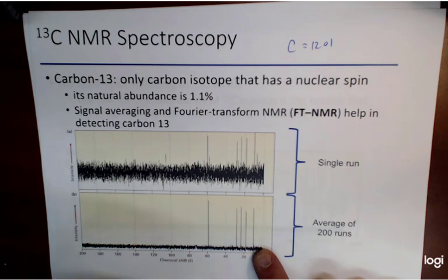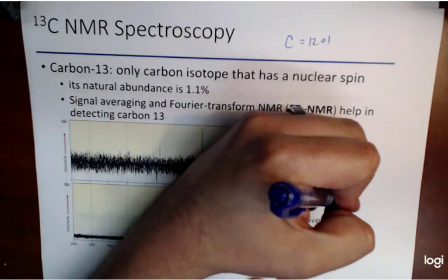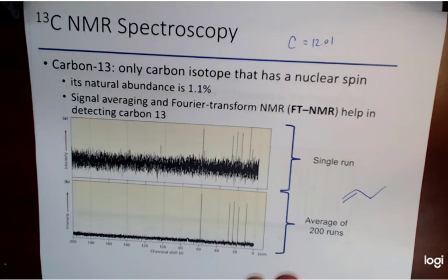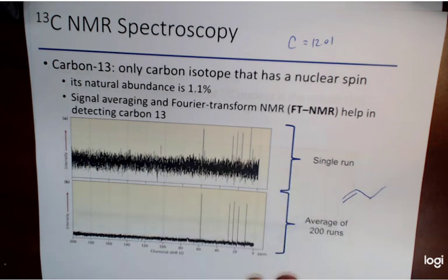Now, with that being said, the other thing is, since carbon-13 isn't a very abundant isotope, we do not see splitting, right? Because it's very uncommon. So, for instance, even if you were looking at that structure right there, you would expect to see 1, 2, 3, 4 different carbon signals. There's no symmetry there, right?